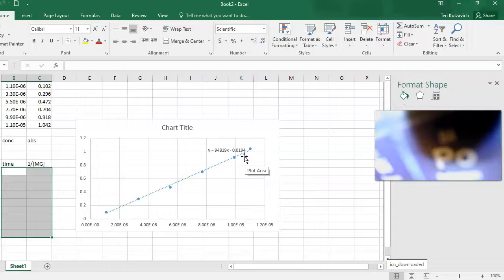You will have to look at one of them. One of them will be linear. Linear is the winner. That's the one that is the correct order for your hydroxide.